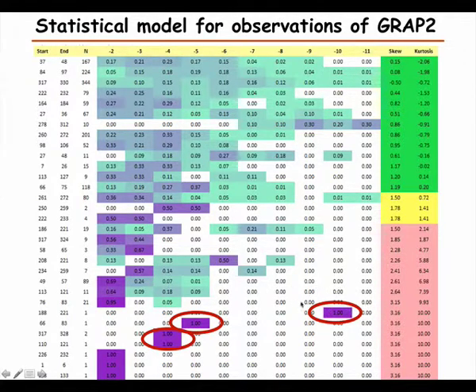Then here we have a case where we observe a peptide at 10 to the minus 10 once. That comes from having such an enormous data set that we will occasionally have very good observations just by chance.